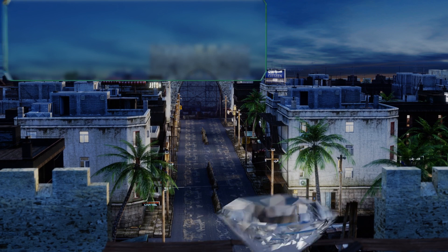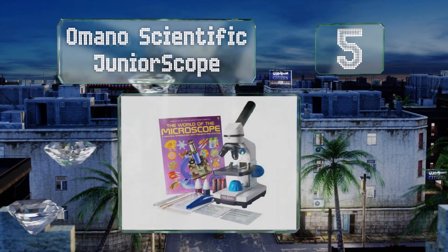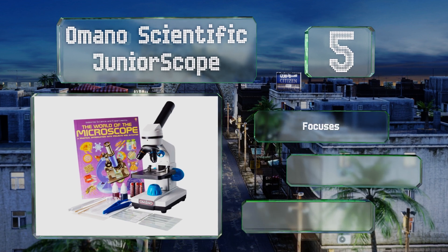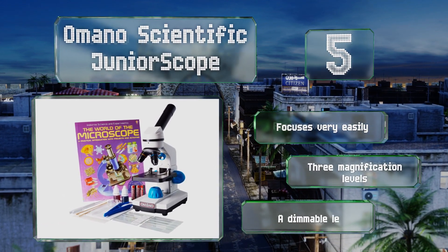Halfway up our list at number five, the Omano Scientific JuniorScope comes with everything a young scientist needs to start conducting research, including labeled slides, dyes, droppers, and a handy instructional book filled with projects and activities.